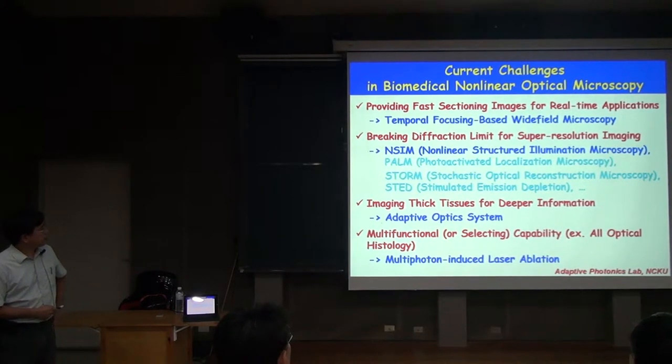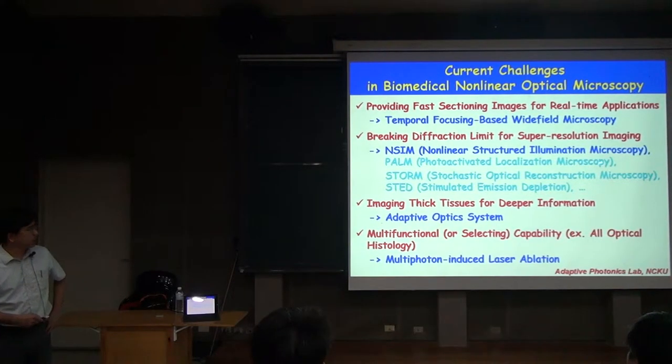For PALM or STORM or STED, it was Dr. Stefan Hell and Dr. Moerner, who worked on PALM and STED, so they got the Nobel Prize this year.